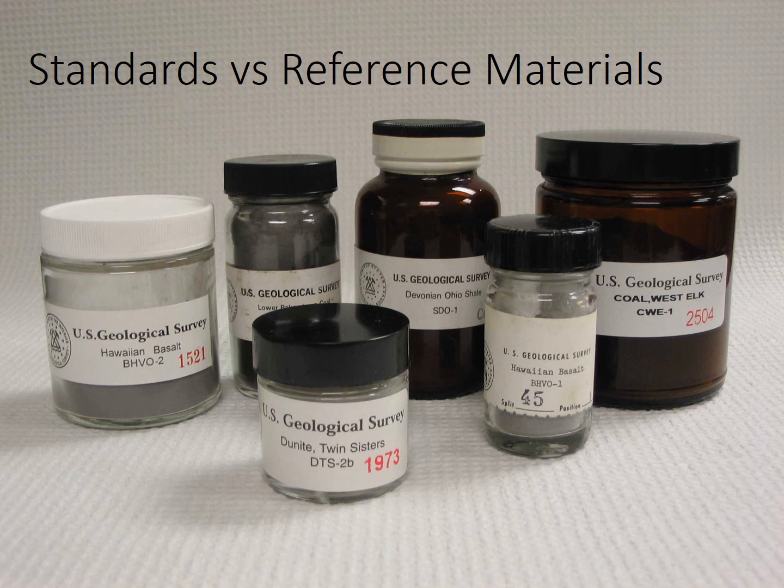What you should almost never do is measure your samples with your standards, then measure some geological materials or reference materials, get the wrong answer, and go, I'm going to correct for that. If every time you make a measurement you get a value that's 50% too high, you could make a nice linear correction for that. You should never do that, although people do. So that's where today's lecture ends.